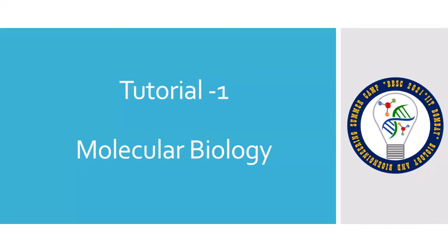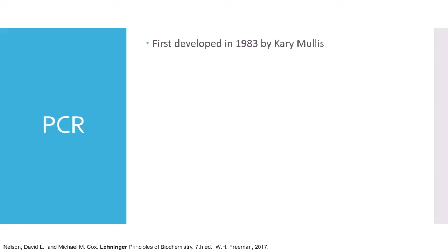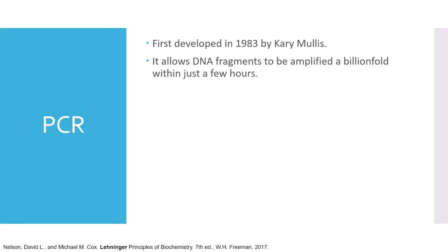I am Akanksha, a project fellow at Proteomics Lab, IIT Bombay. I will introduce you to the basics of PCR. The polymerase chain reaction, or PCR, has become an indispensable part of molecular biology. It has been used widely across the globe. First developed in 1983 by Kary Mullis, it allows DNA fragments to be amplified a billion-fold within just a few hours.